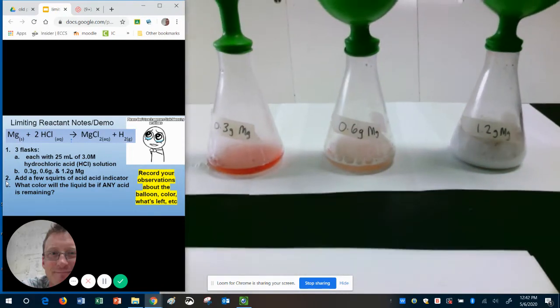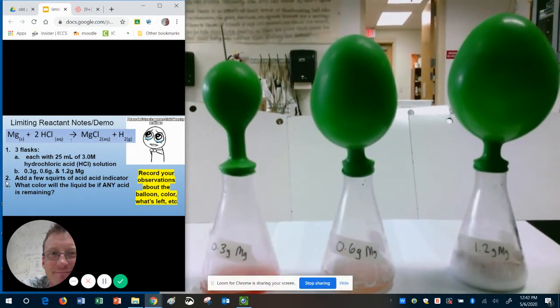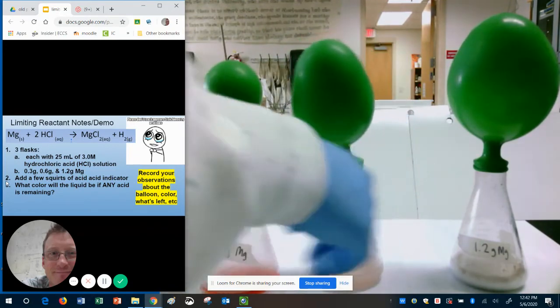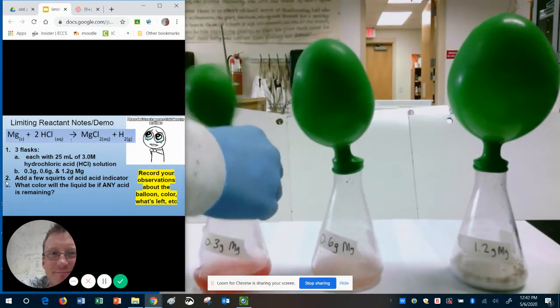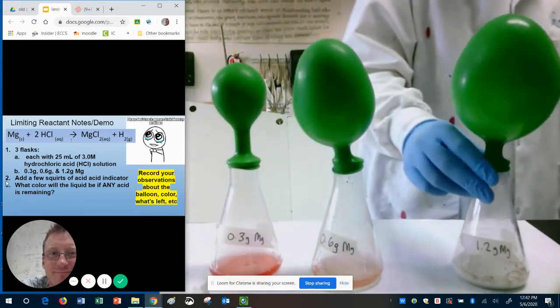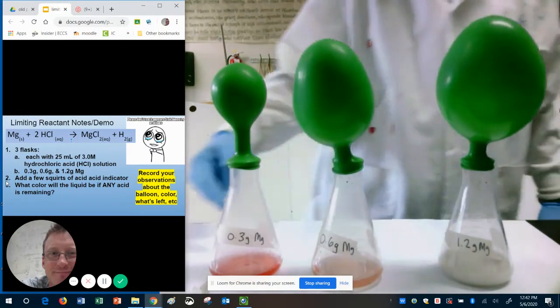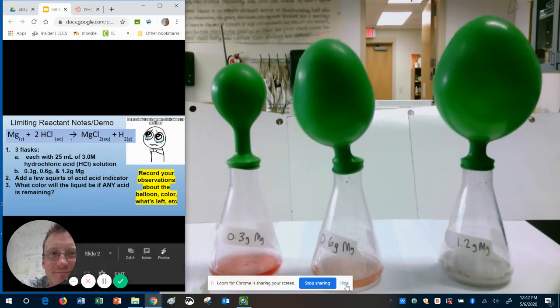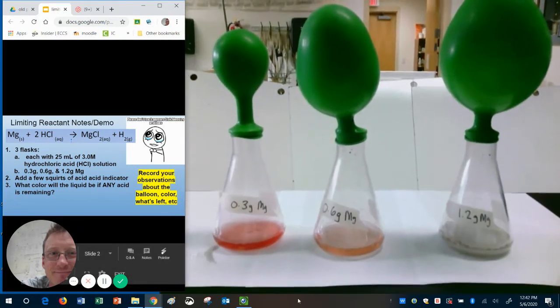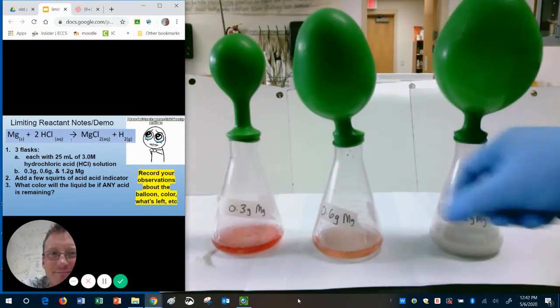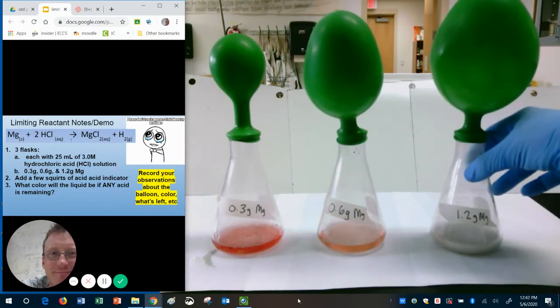I'm going to move my camera view here. You can see, mix them up a little bit. We still have a bit of that reaction happening. First one now looks like it is pretty much done. Second one is also pretty much done. Third one is still really, really cloudy, but now notice here what we see.